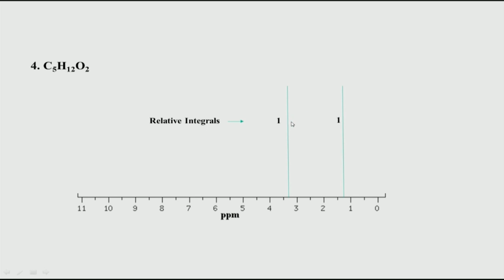So, if I take this as a reference, in terms of the height of the peak, this height is the same, the area is the same. So, I would say this is equal, but it does not tell me the absolute number of protons. So, there is a big issue. Only if I had another reference here, let us say TMS, which has 12 hydrogens. If I know that the TMS peak corresponds to some x hydrogens, relative to that, this could have given me a more correct picture, but that is what we do not have.